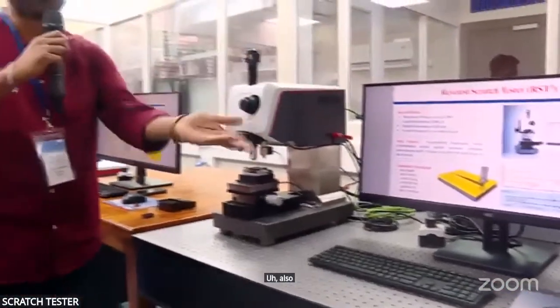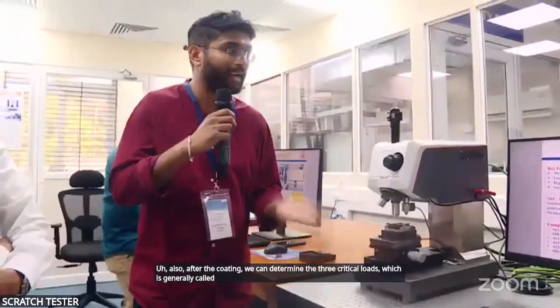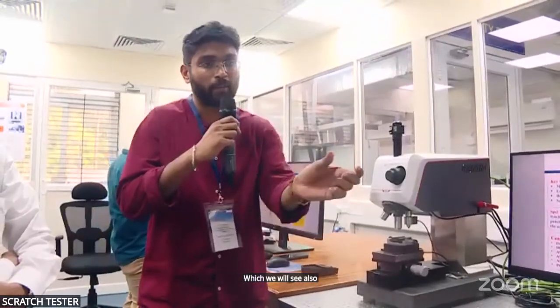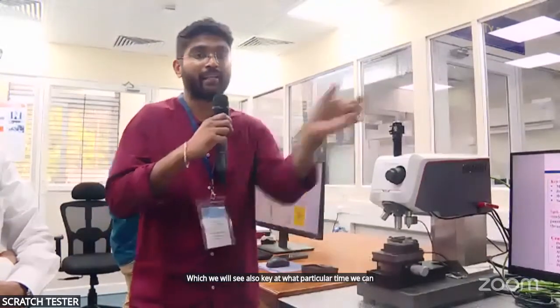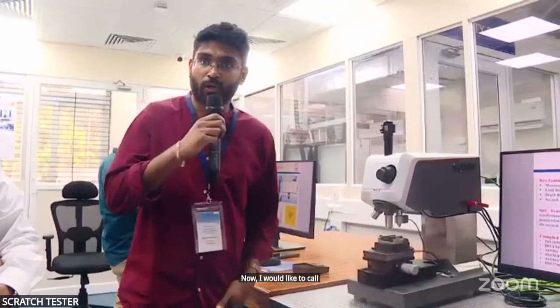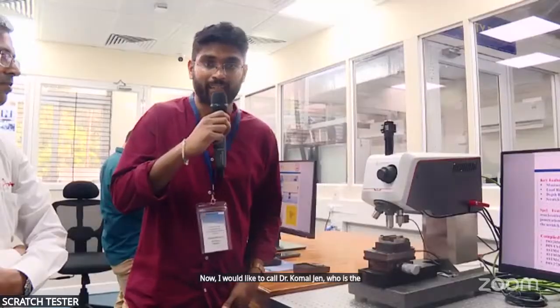During this scratching experiment, different sensors like acoustic emission sensors and friction sensors are attached, which give in-depth knowledge of the different variations during the coating failure. Okay, this is all about the introduction to the scratch testing machine. Also, after the test, we can determine three critical loads, generally called LC1, LC2, and LC3, which we will see after the scratch testing experiment. Now, I would like to call Dr. Komal Jain, who is the application scientist at Anton Paar.